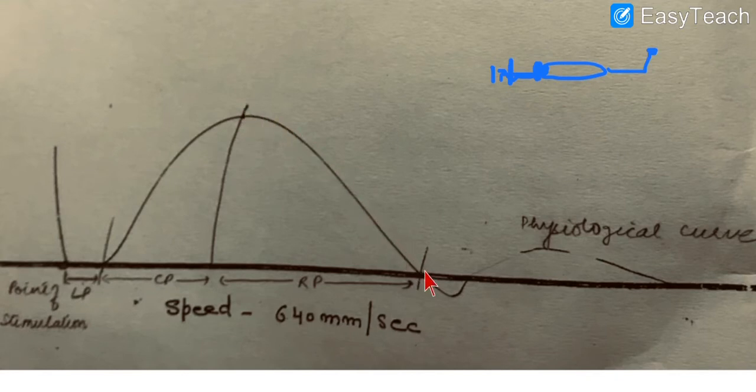And this is the baseline. Our marking pen of the lever should stop over here, but it's not stopping, it's going downward, then it's coming upward. Sometimes we get a slight one or two deflections over here. Why is that happening? That is happening because of the momentum of the lever. If anything is stationary, to start its movement it will provide resistance, that inertia.